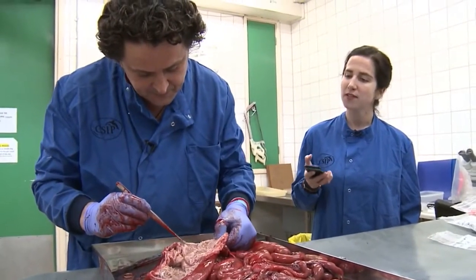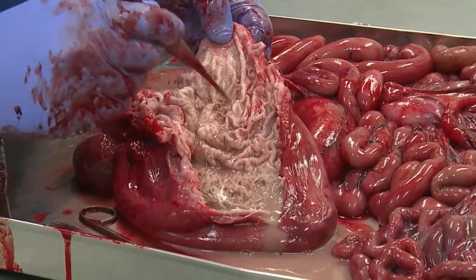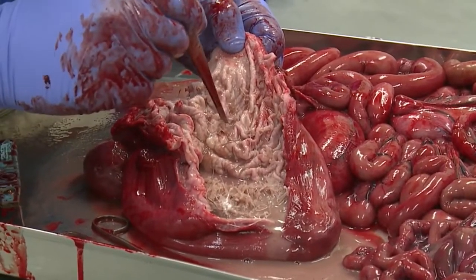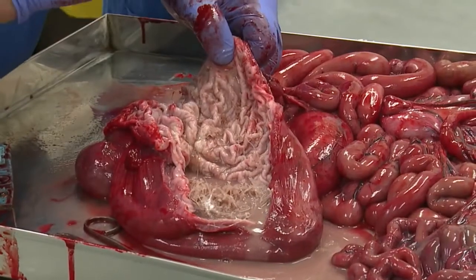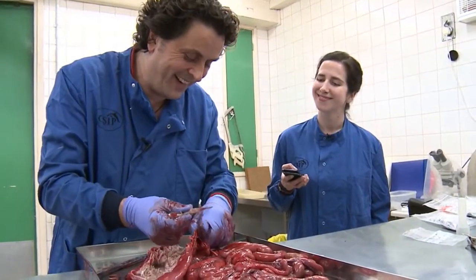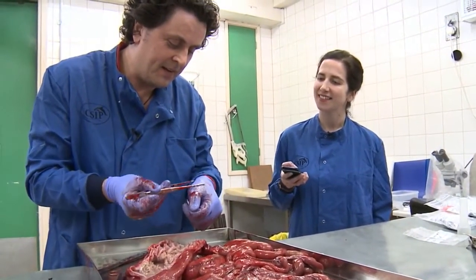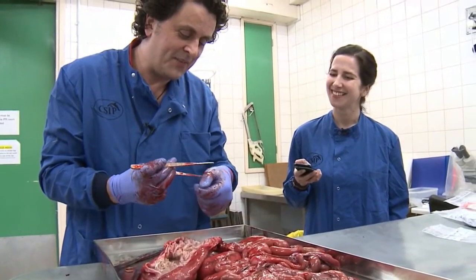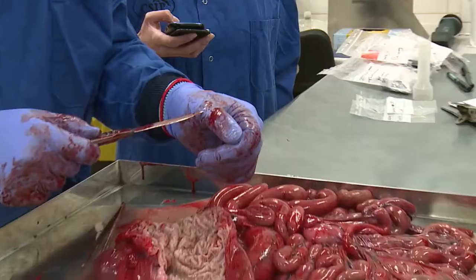And can you identify the species of fish then, just from the ear bone? Yeah, so the otolith is a kind of ovoid, okay, there's one. Ovoid bone. I'm going to drop it now. Come on. Stubborn bugger. Right, okay. Thanks, Matt. Try and put it back.